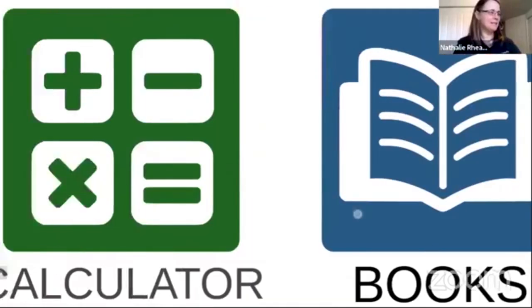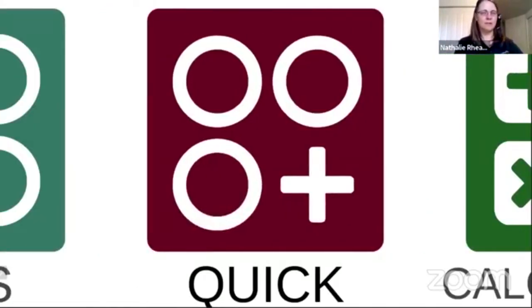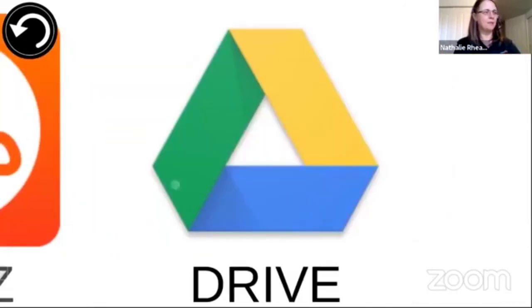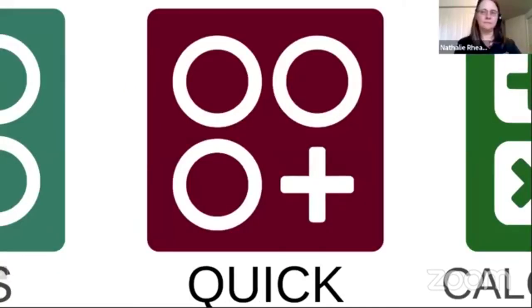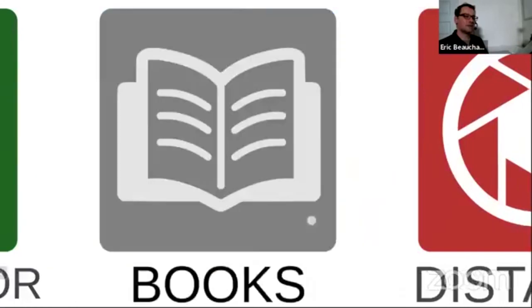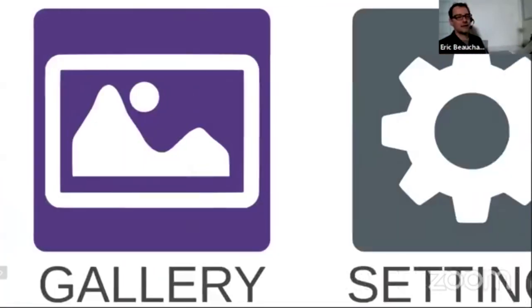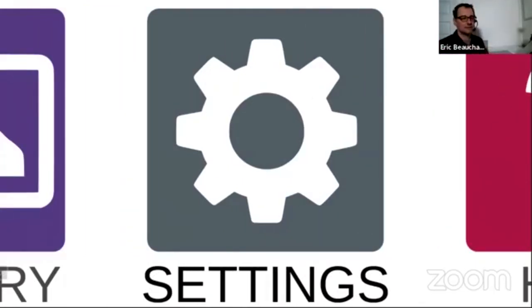Somebody's saying that it looks like there's a limit on the number of quick access we can add. I reach a limit here, but when I'm in tile, I don't. So let's go and show tiles. Yes. It's just that we limit that number because it's a big carousel, and sometimes it could be a long way before getting to the application. So it could end up being longer than just going into apps and searching your application in the list.